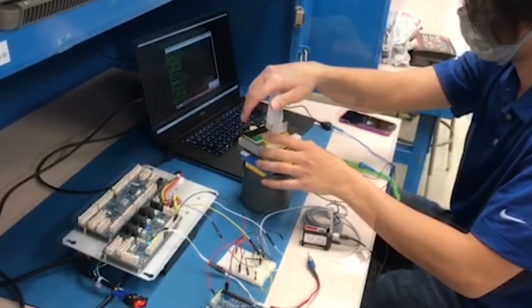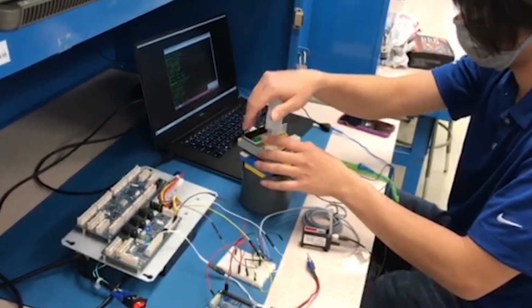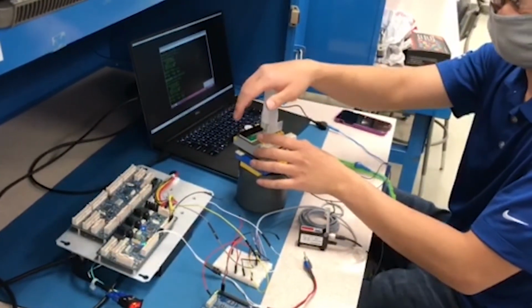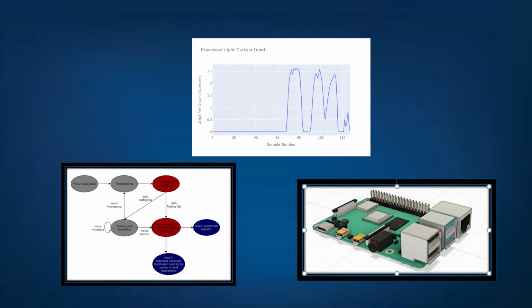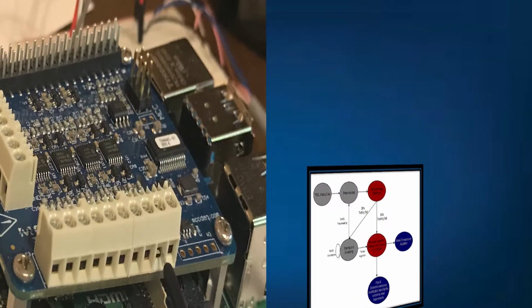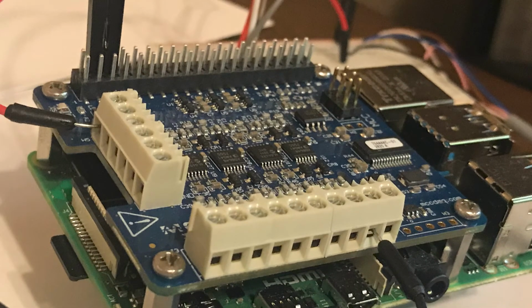Then, the Raspberry Pi begins reading analog input data from the light sensor using a data acquisition hat. The Pi then pre-processes the input and uses the pre-trained algorithm to produce a volume measurement. This volume measurement is then output back to the benchmark Ultra using pulse width modulation. Additionally, all of the raw and processed data is logged along with the predicted volumes on the Pi, to be used by technicians in debugging and in further development.